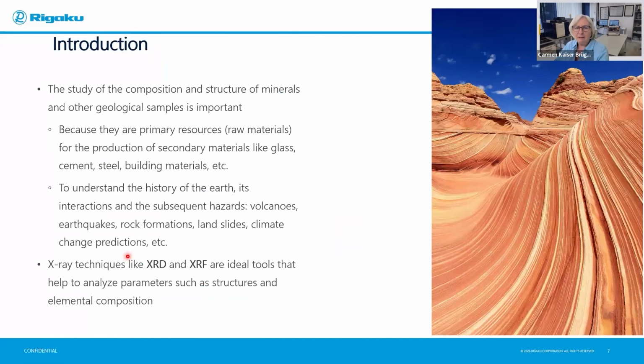So yes, as an introduction, very often we use X-ray techniques like X-ray diffraction, X-ray fluorescence, which are ideal tools that can help us to analyze parameters. Like, for example, X-ray diffraction will give you the structure of the minerals, and X-ray fluorescence will give you the elemental composition. So very briefly, in order for us to understand the mineral or the mining side, we need to use these kinds of techniques to understand the quality of our mineral.